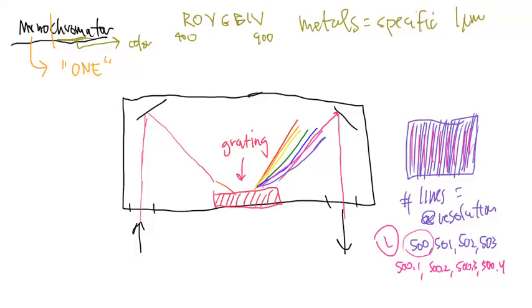Now, you're probably scratching your head for a minute and you're saying, well, wait a minute. I thought that the bulb gives off the wavelength that's specific to the metals that I'm trying to analyze for. And the answer is yes, it does. So, for instance, if I have a copper bulb, that bulb is typically going to give me one wavelength that we call the primary wavelength, and that goes into the sample, which then makes it to the detector. However, in between that, we get a monochromator.